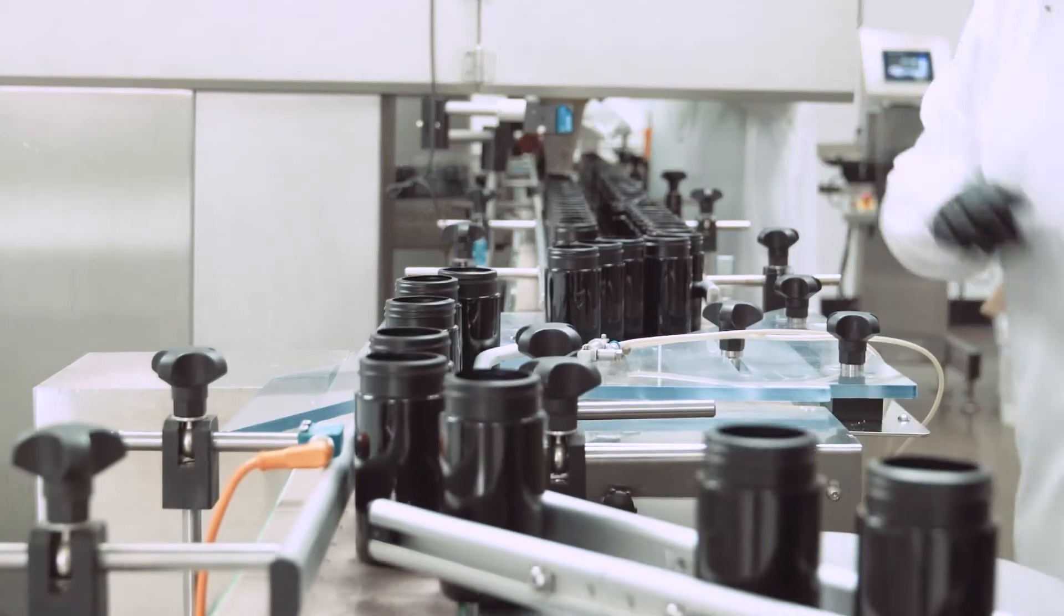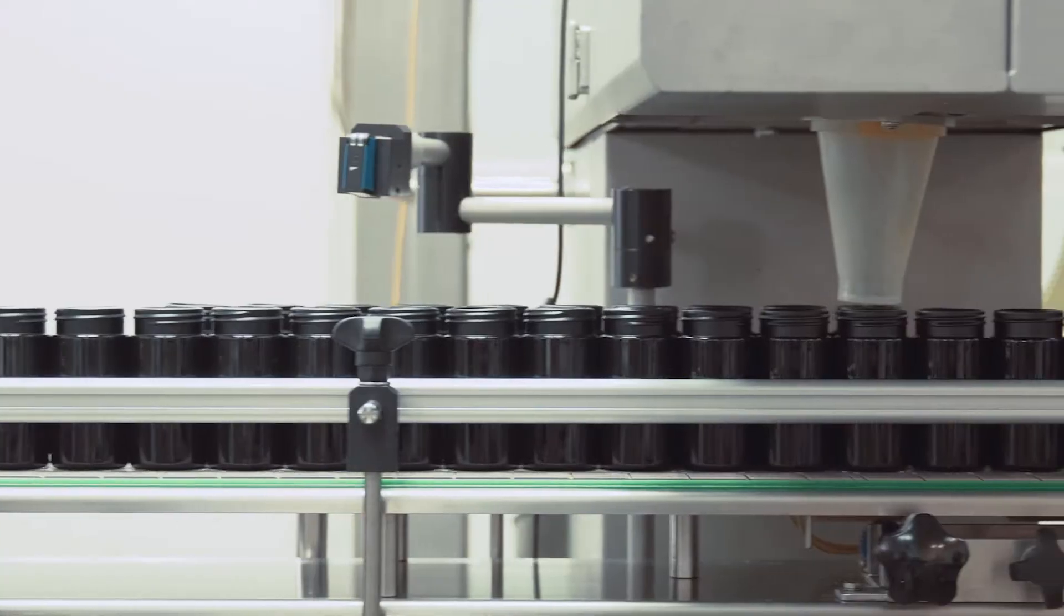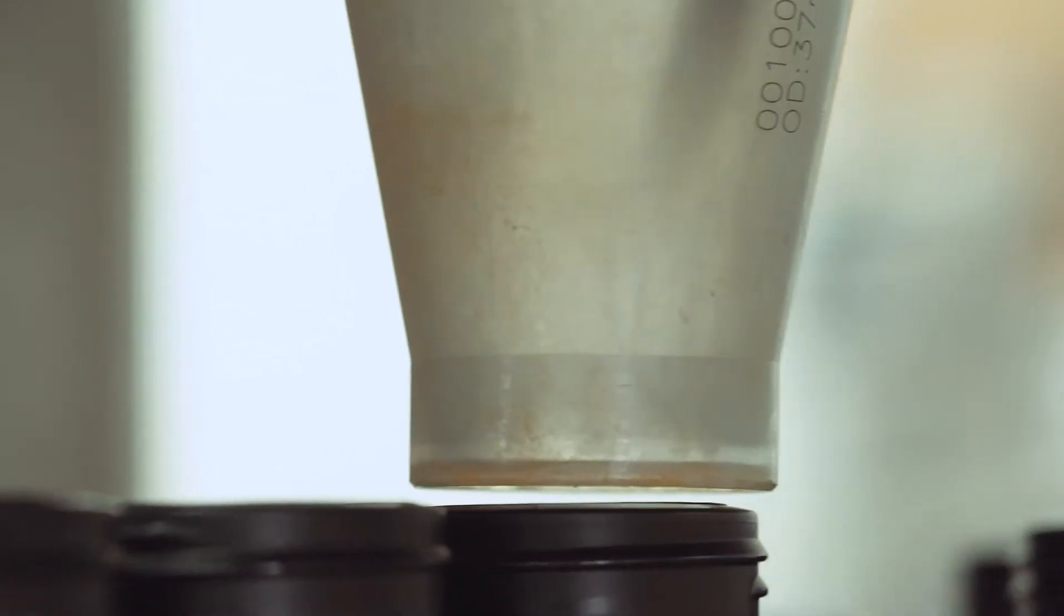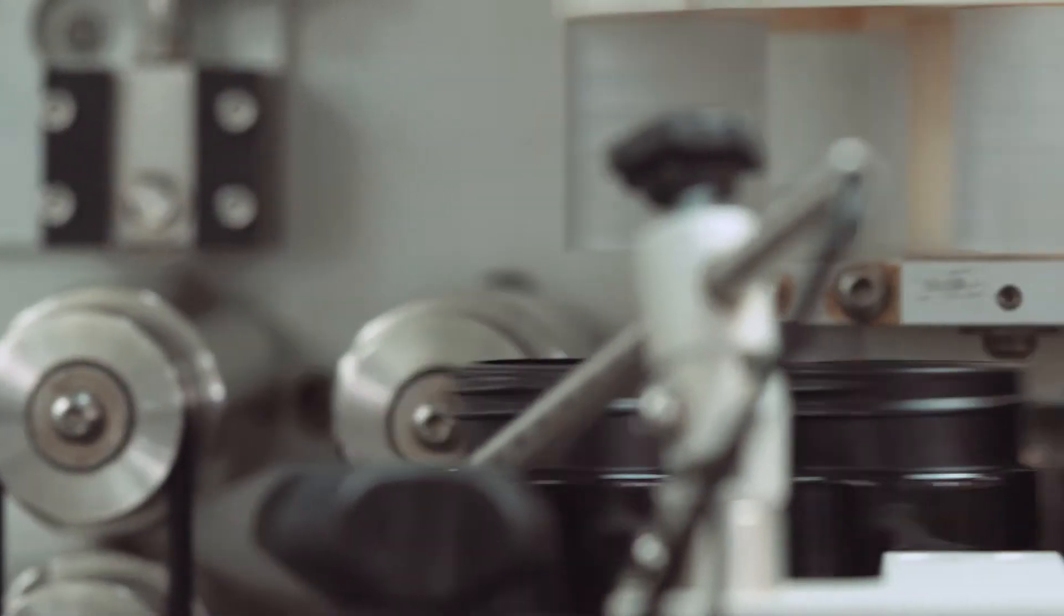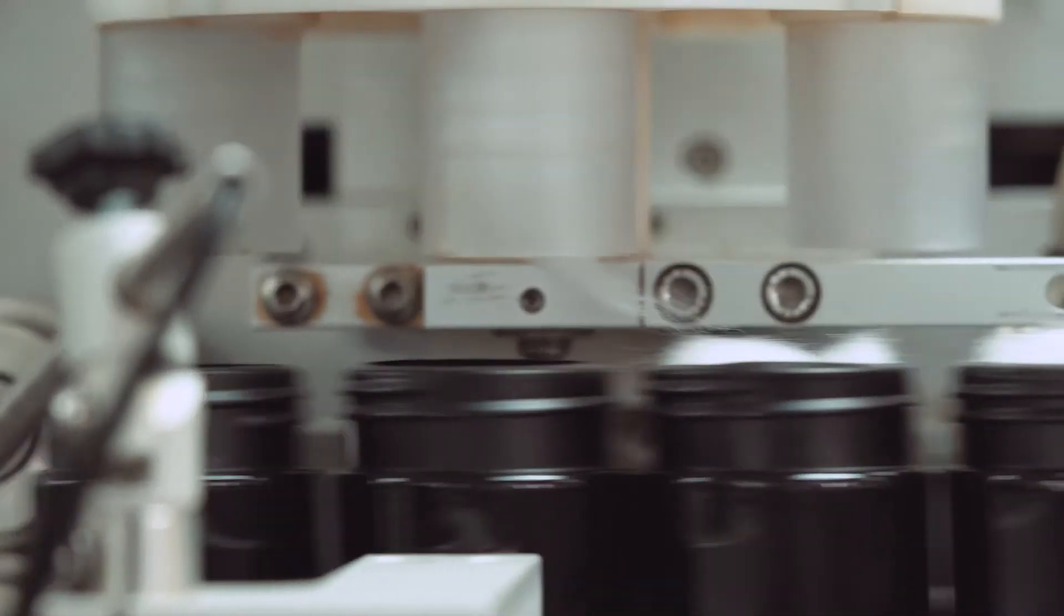The capsules are then filled into uniquely designed bottles. These bottles are UV treated to increase the moisture barrier and to preserve the quality and integrity of Stemregen's stem cell enhancer blend.